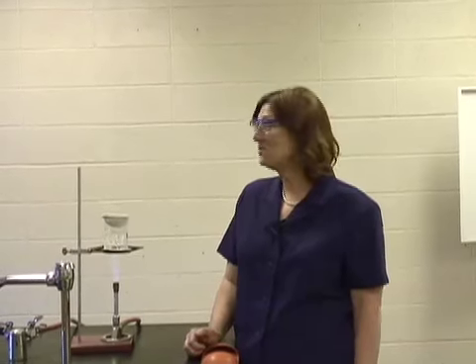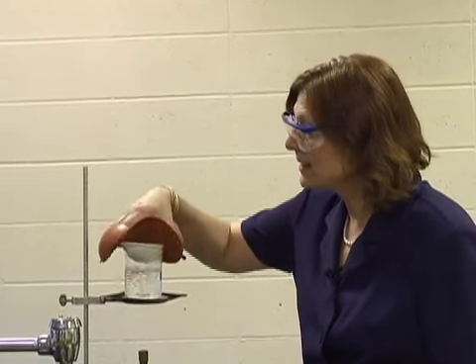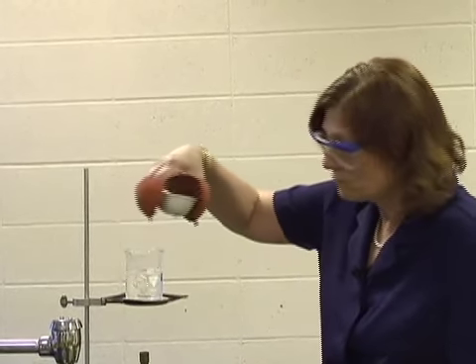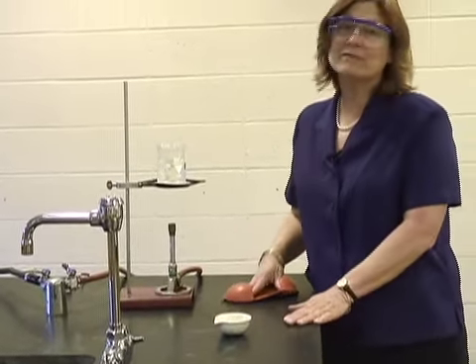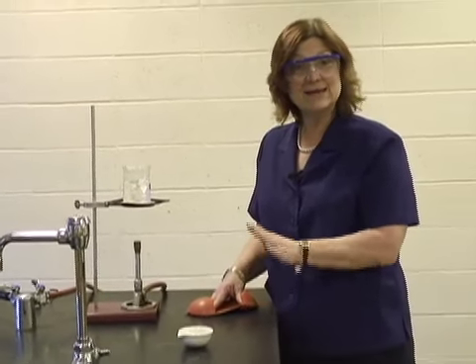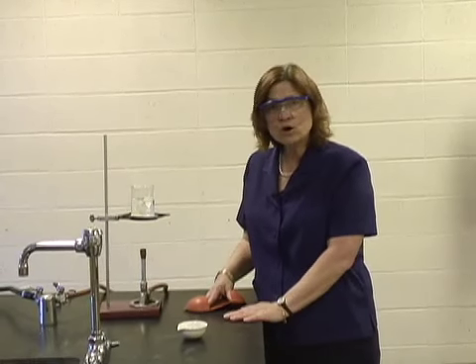Well, I believe that the copper is dry now, and you were able to get a bird's eye view of that copper and see the color change and see its beautiful red color. And it is definitely uniform in appearance. So I will turn off the Bunsen burner, sadly enough, and I will cool this. And I'm using my hot hands here to remove the evaporating dish and set it on the lab station.